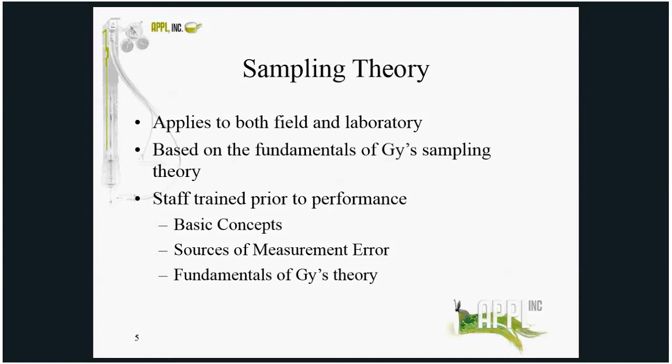Understand that there are many ways to subsample in the laboratory, and proper training is the only way to ensure that it is done properly.